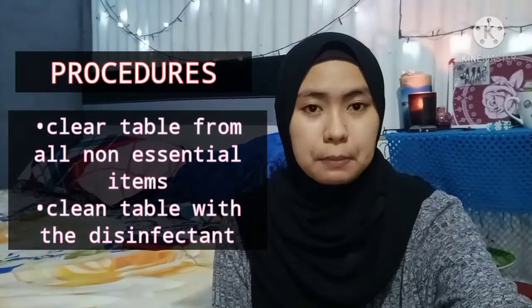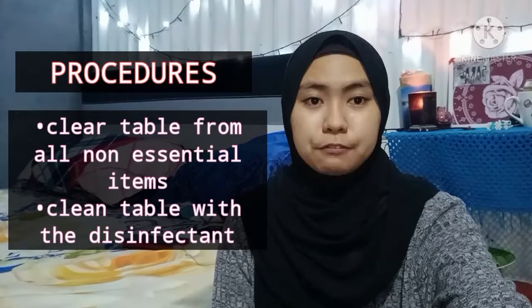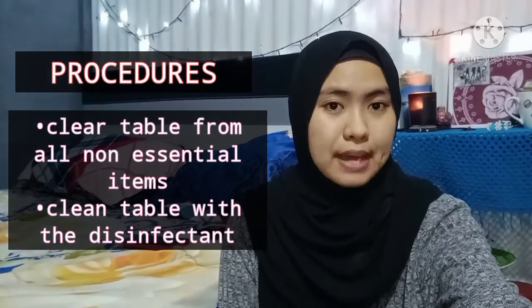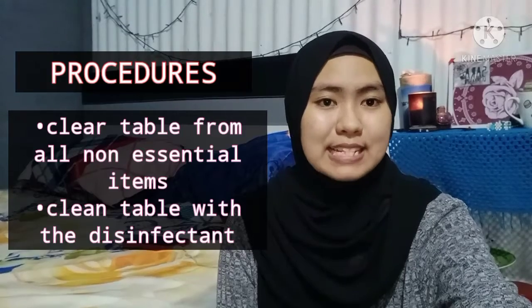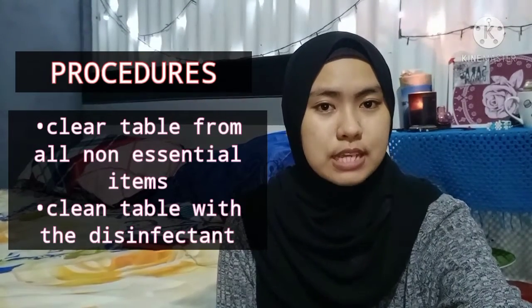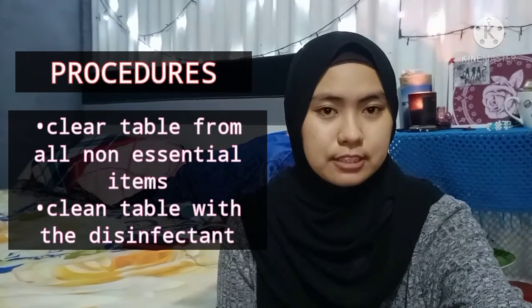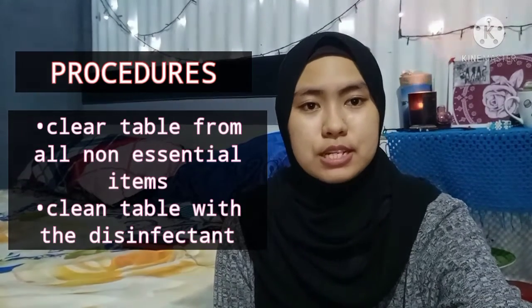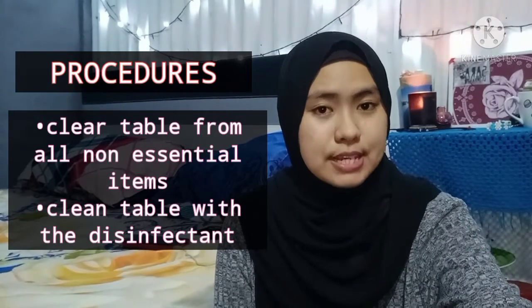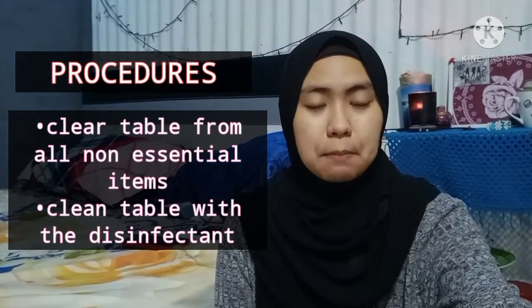So the first step is always the preparation of the work area. We have to make sure that the workspace is cleared of all non-essential items, and the table must be cleaned using the disinfectant. This step is important to kill all unwanted bacteria and so decrease the chance of the agar plates becoming contaminated.